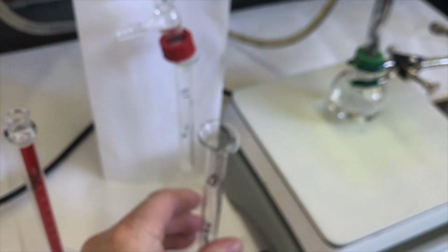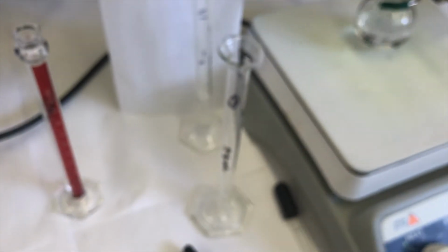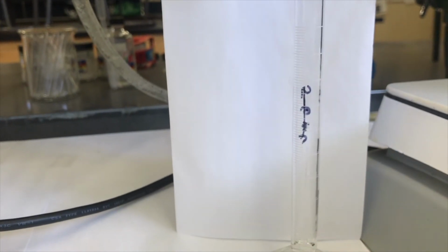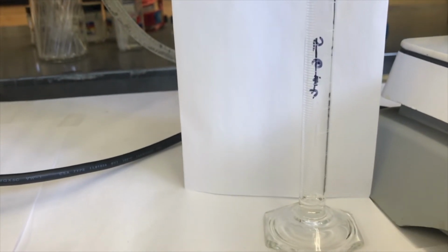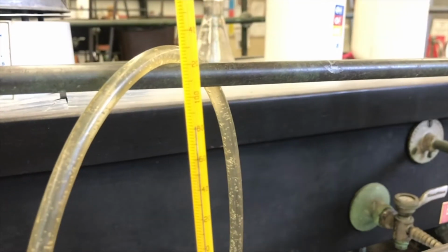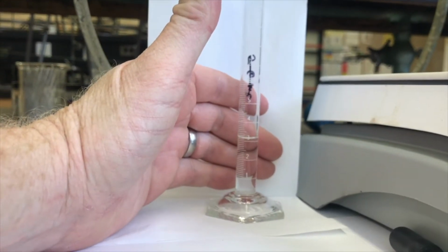I'm going to switch it over now to a new third graduated cylinder. Okay, so now in my third graduated cylinder, I'm going to get to 1 milliliter and then see what temperature I'm at. I've got a temperature of about 80 degrees Celsius. Okay, it's about 81 still. It's holding at 81. And now I'm at about 2 milliliters in my third one, and I'm still at 81 degrees. We're at a little past 3, say 3.